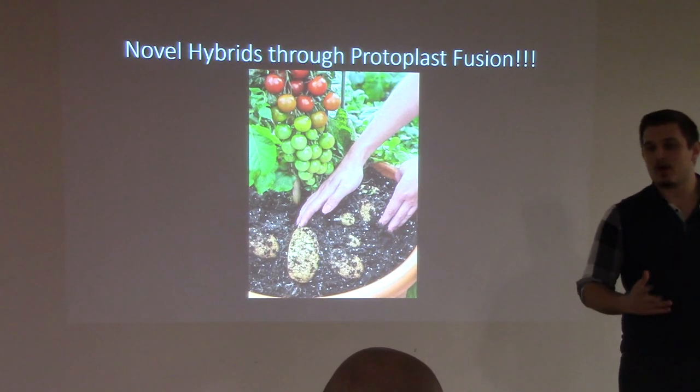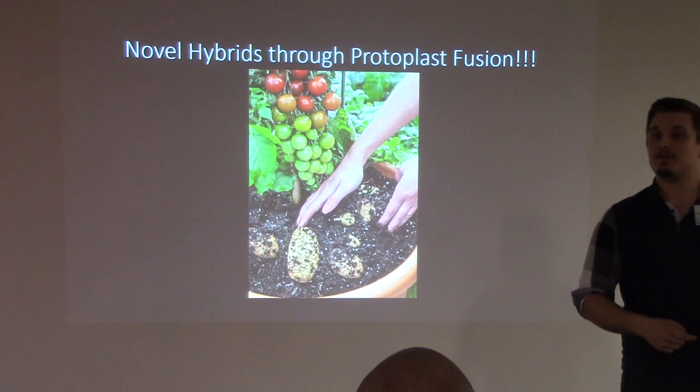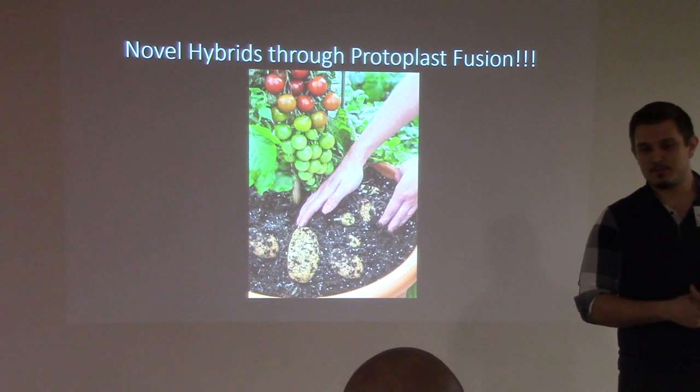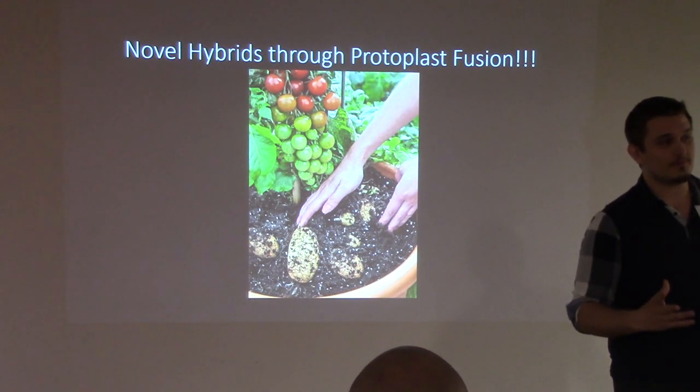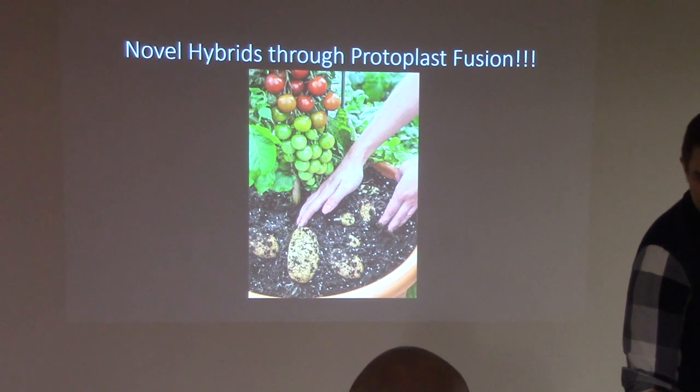This is where artists come in, which I have the great fortune of working with at the School of Visual Arts in the BioArt Lab. Suzanne Anker, the chair of the art department, basically babied this small space into a very functional BioArt Lab, where I get to help students do crazy stuff like this. One of the projects we're working on is a novel hybrid that no one's ever seen before. So we're going to use a technology, which I'm going to explain right now, to actually do that.